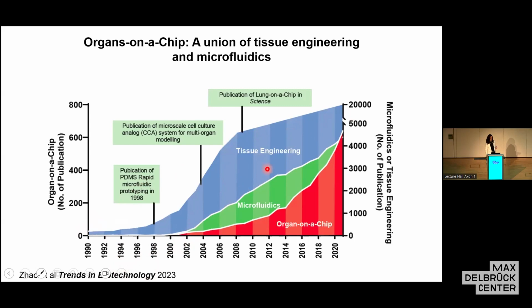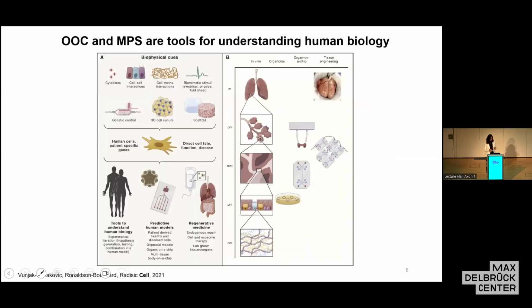And at the same time, George Whitesides figured out how to make microfluidic devices from silicone, PDMS. It's silicone with an E at the end. And how to put cells in these microfluidic channels. So together, using advances from these two fields, we can see that organ on a chip arose. And really, Don Ingber used that word the first time in his Science paper in 2010. But people were doing this kind of work even before. And you can see the field is really on an exponential increase.